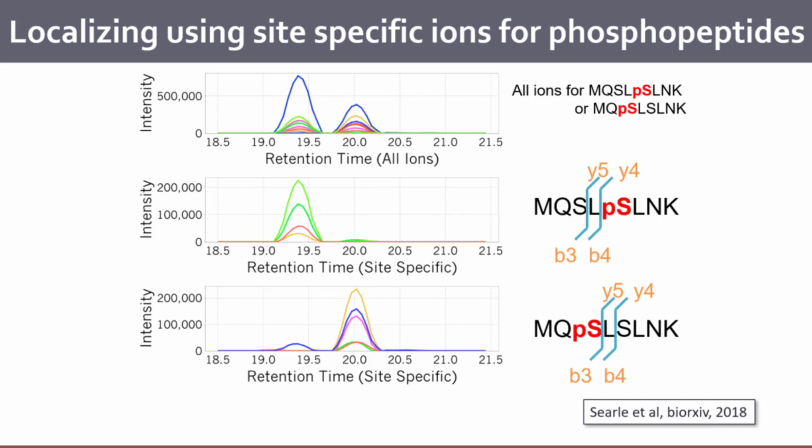So Gavin Reed was basically saying that in the gas phase, the phosphorylation can rearrange to the other site. So in the collision cell, this phosphorylation is now localizing itself to the other site, the other serine. It's another whole problem. That's a challenge to work through, right?